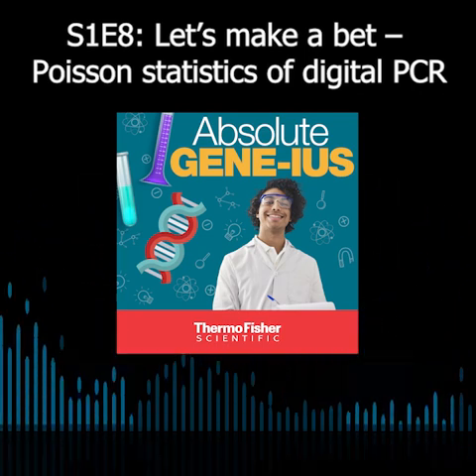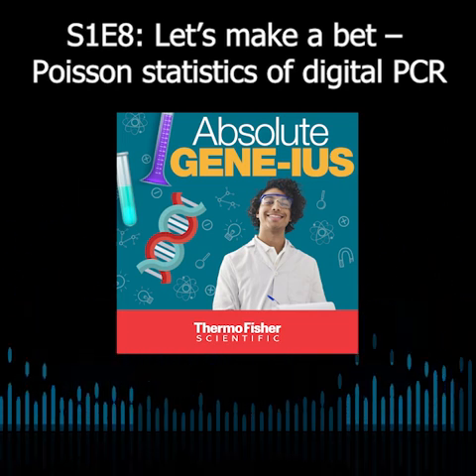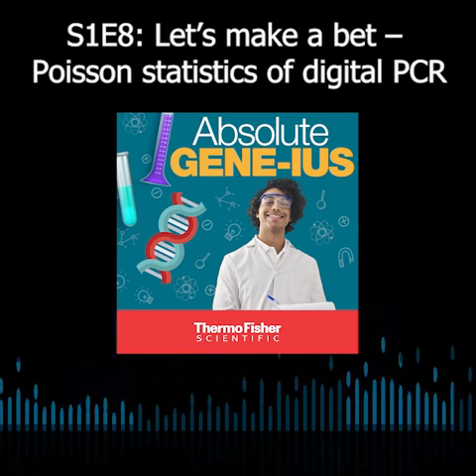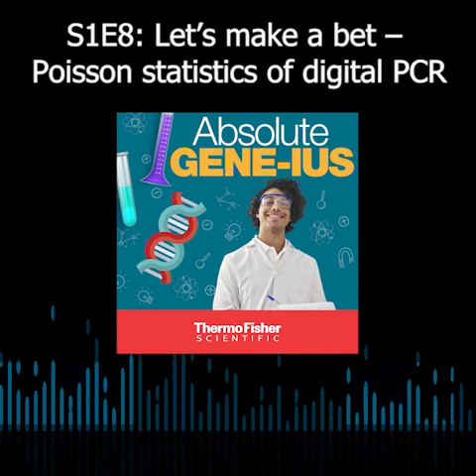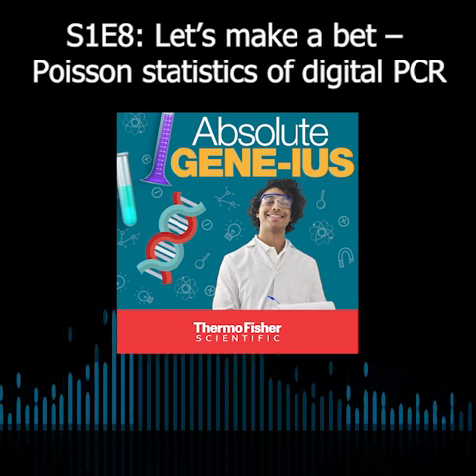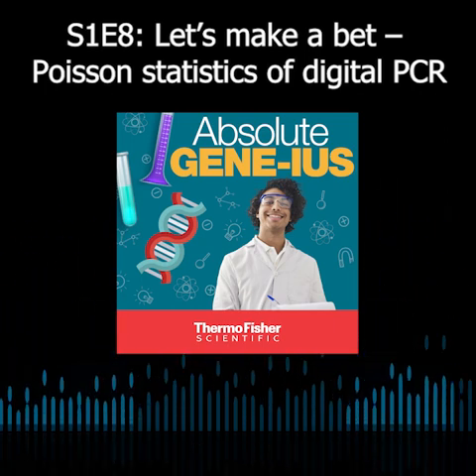It's really interesting. Are there any other considerations when looking at rare targets? Yeah, there's a couple considerations for digital PCR. If you're looking for a rare target, you really want to cram in as much of the sample into the experiment as possible. But people often think that just because you're loading the sample into the instrument, it's actually being used. And there's a concept known as dead volume, where I might load 20 microliters of reaction mix into my instrument, but only a fraction of that, say half of it, is actually analyzed. It's actually making its way into one of those mini reactions and getting called.